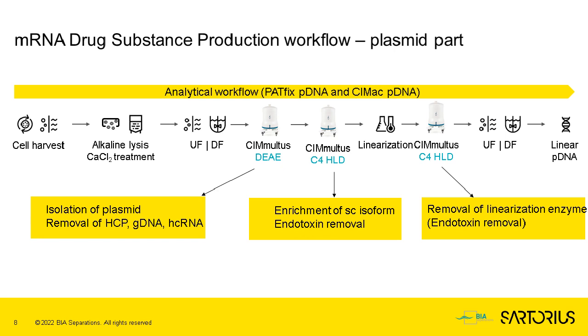The regulatory specifications for the use of plasmid as a therapeutic agent itself are clearer, but those shouldn't necessarily apply to the plasmid as a raw material, because there's, of course, multiple downstream processing steps still following from the plasmid. Nonetheless, one of the critical questions that we get is, what is the necessary level of purity of supercoiled plasmid versus open coil?